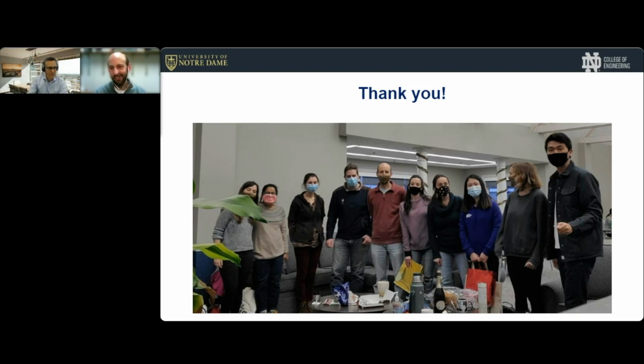Thank you, Luca. That's a very interesting question. I think there's definitely potential for different microbial communities to result in different biofilm morphologies. We have not specifically looked at that, although along the lines of your question, I think the morphology also is different in counter-diffusional biofilms from co-diffusional biofilms.